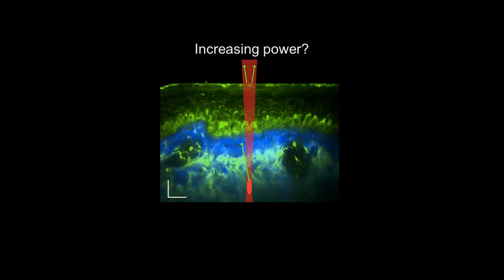It acts differently on the beam in different locations. And on the right side, you've lost signal completely. And that's not due to an optical design, that's because the tissue has extinguished the light above it completely. That's very true.